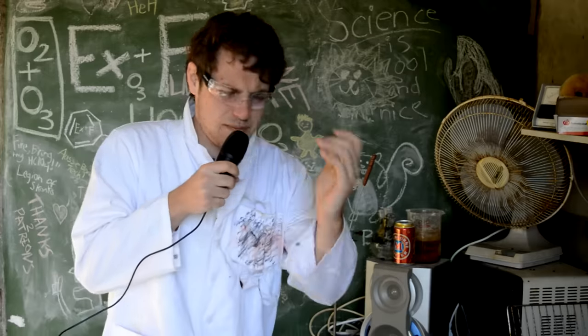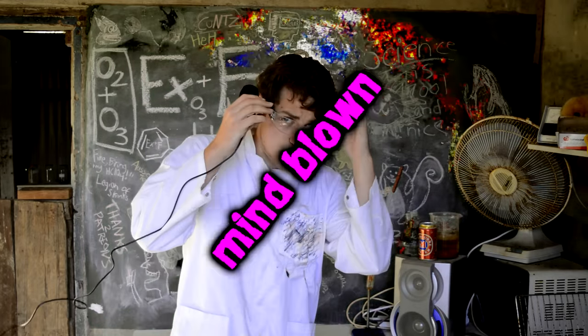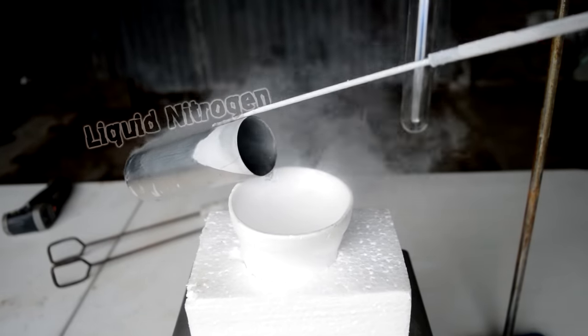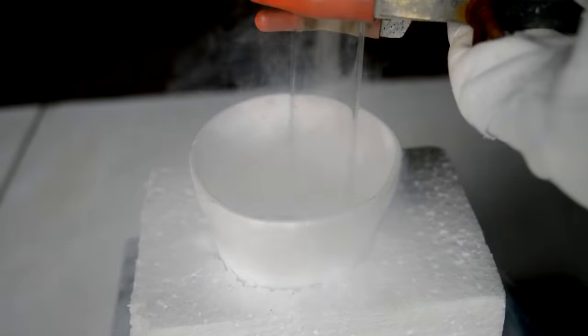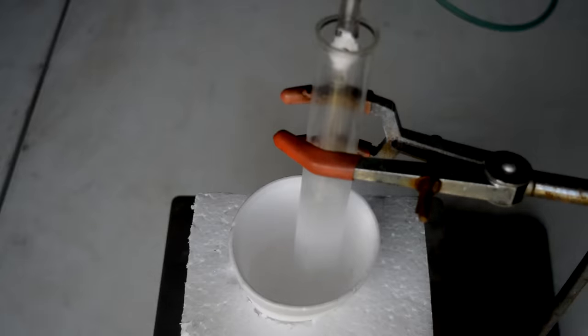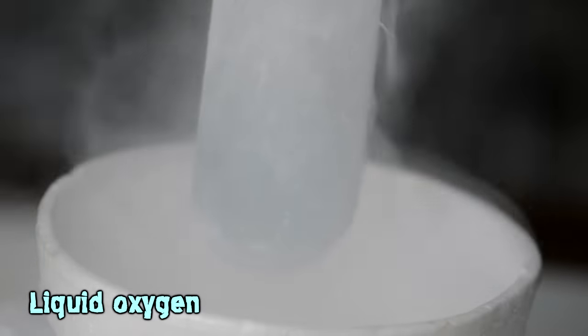You know how this story goes. Things burn using oxygen. If we increase the oxygen concentration, they burn better, right? We can condense liquid oxygen because its boiling point is just ever so slightly above liquid nitrogen's boiling point. So if we get a test tube, immerse it in some liquid nitrogen, and pump oxygen gas through it, the oxygen gas will condense and form a liquid. The liquid oxygen is a very pale, sort of baby blue colour, but it's very hard to get a good shot of because it's so cold, any moisture in the air will condense on the tube rapidly and freeze.